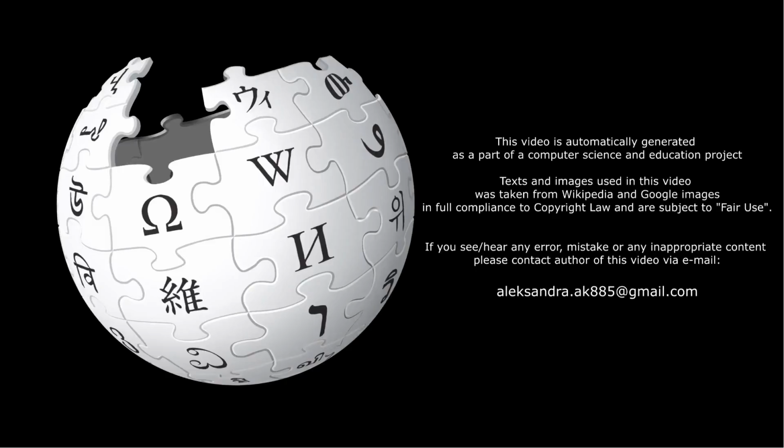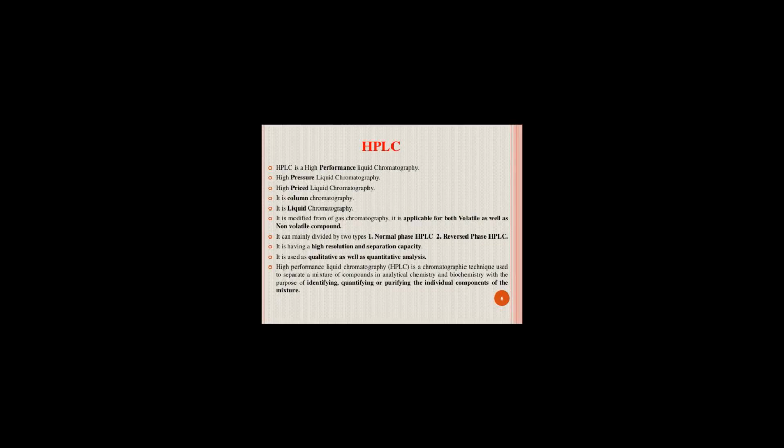Gas chromatography, GC, at the time was more powerful than liquid chromatography, LC. However, it was believed that gas phase separation and analysis of very polar high molecular weight biopolymers was impossible. GC was ineffective for many biochemists because of the thermal instability of the solutes. As a result, alternative methods were hypothesized which would soon result in the development of HPLC.